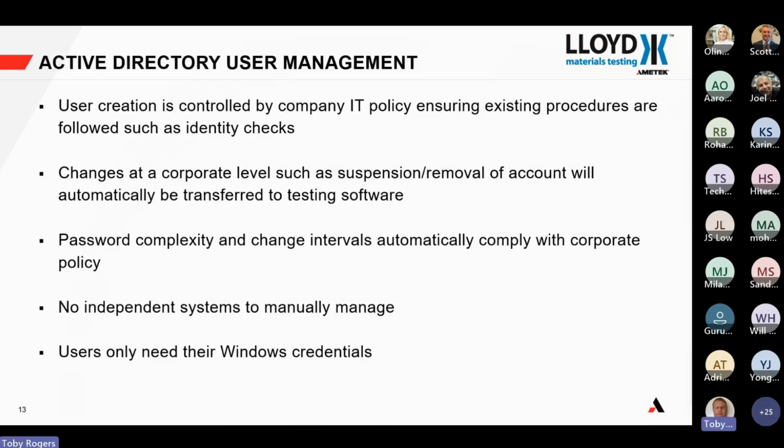The Active Directory user management is very, very useful. So if a laboratory system can hook up into the Windows Active Directory, then we fulfill a lot of parts of 21 CFR Part 11, assuming your organization's IT policy complies, because user creation is controlled then by the company's IT policy.